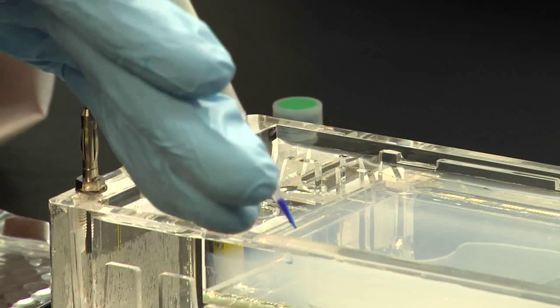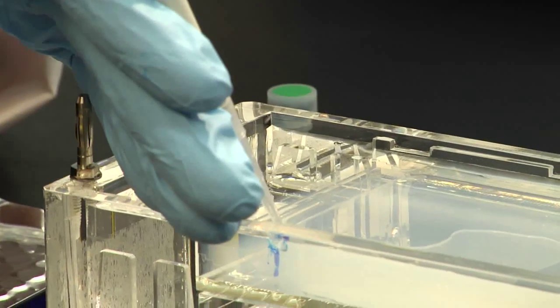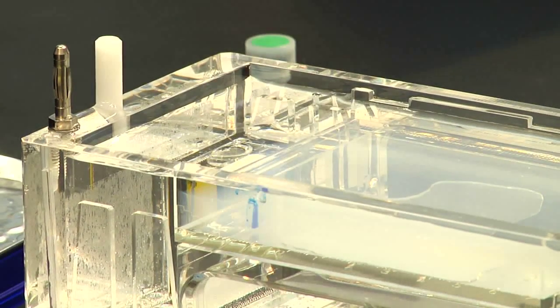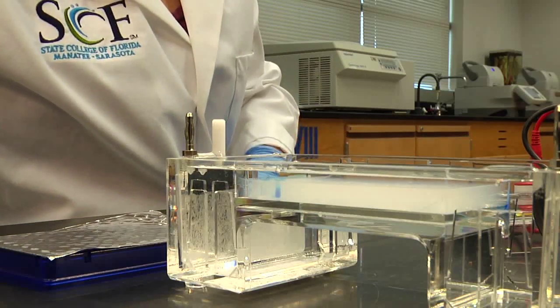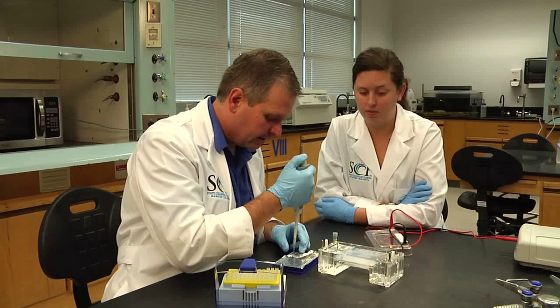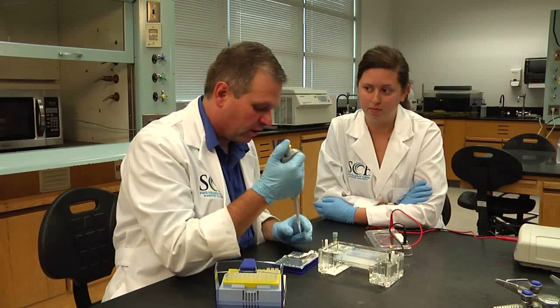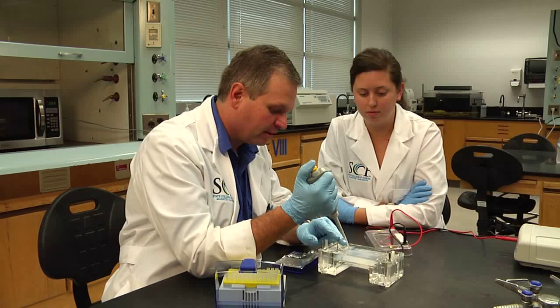We're going to come in and add our sample into the well. Lindsey, why don't you go ahead and load up a couple for us. This may seem like a simple thing, but this is an important skill to develop. It's one thing that's going to allow you to step right into any of the biotech jobs in the area and start working right away, and just impress those employers that you already know how to do all this.